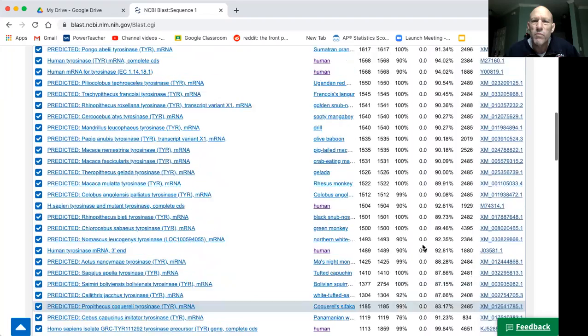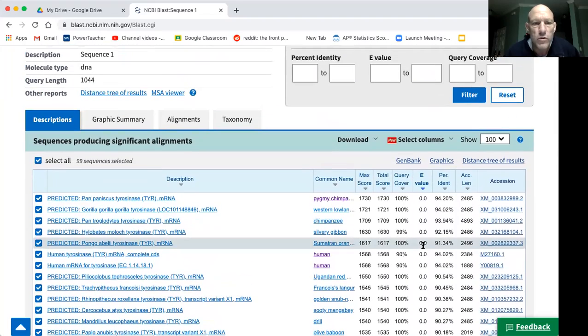And again, it's easy to get overwhelmed, which I don't want you to do. What I do want you to do is take a look at a couple of things on here.